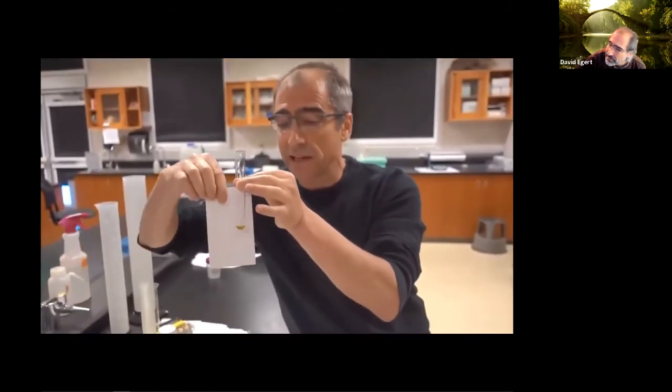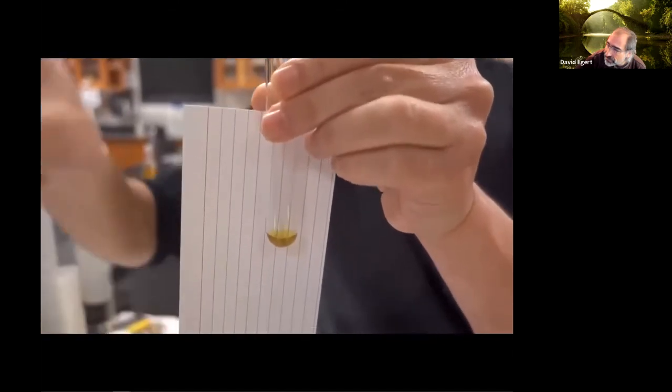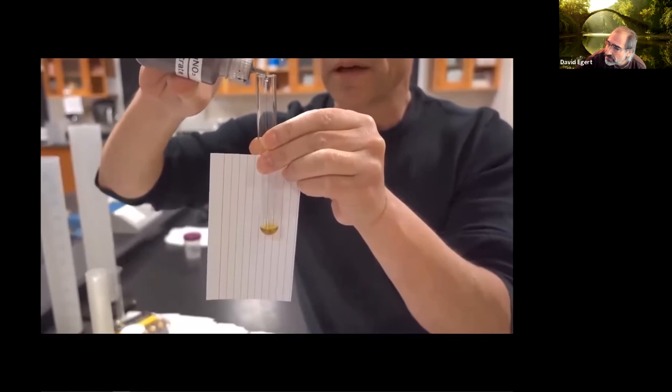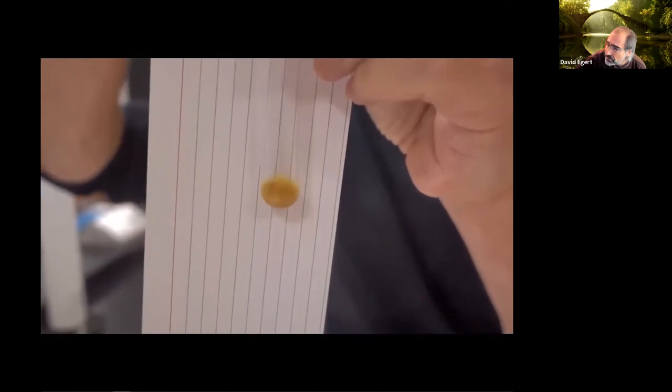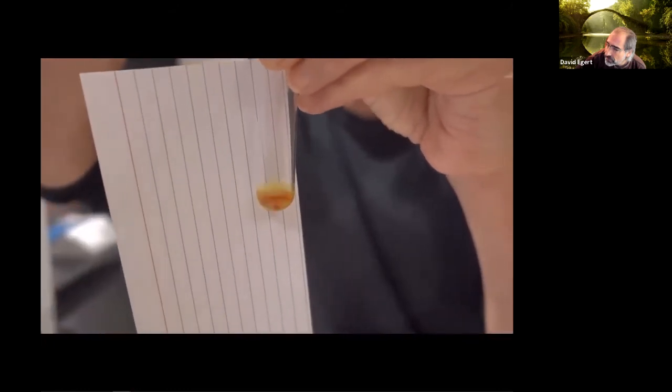And again, you can see it's yellow when I start. Does this help? Yes. Okay, I'm going to add in a drop. You see a little brown show up? And then 2, 3, 4, 5, 6. I need to kind of look at it. Still looking. 7, 8.